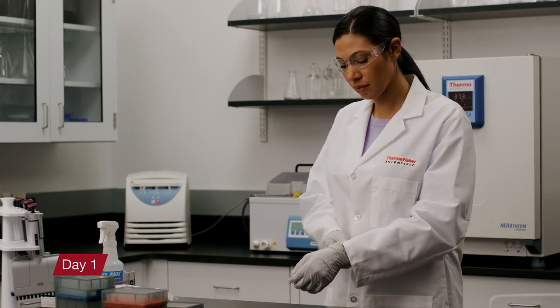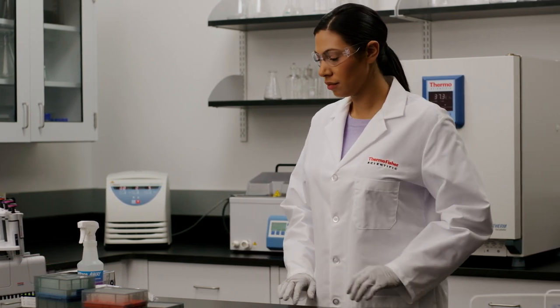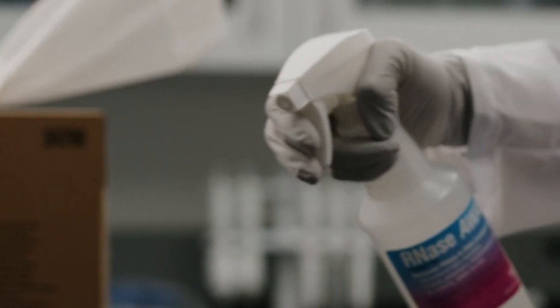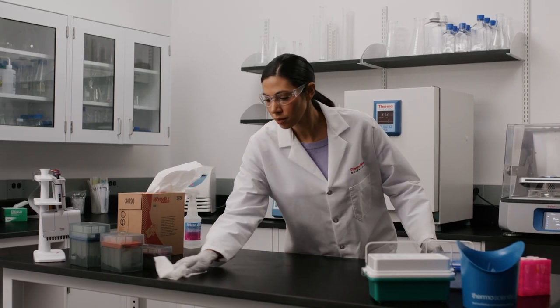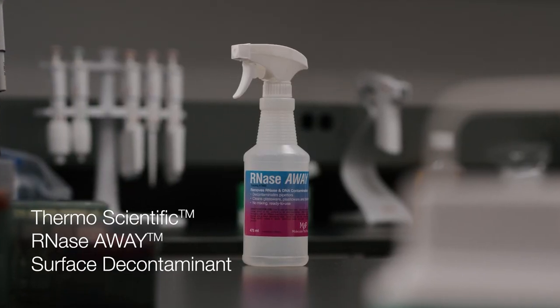Following a successful plasmid development that contains her gene of interest, Maria begins the transformation protocol by decontaminating her benchtop using ThermoScientific RNase Away surface decontaminant.